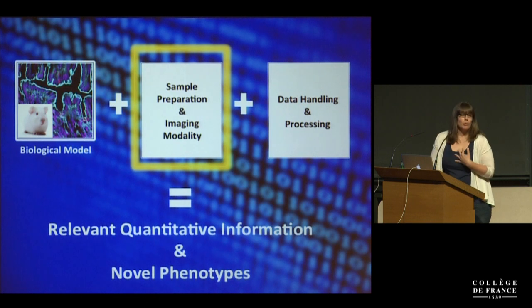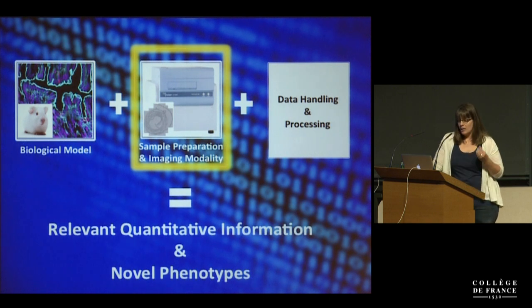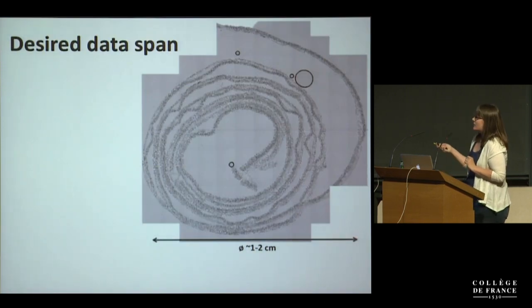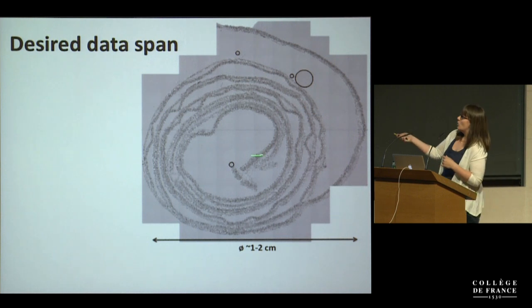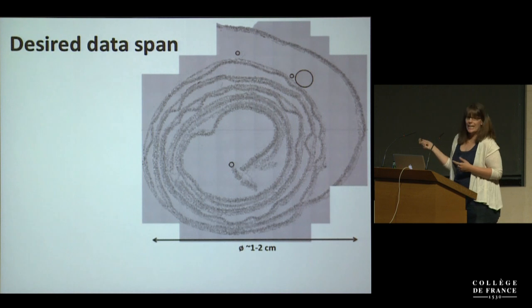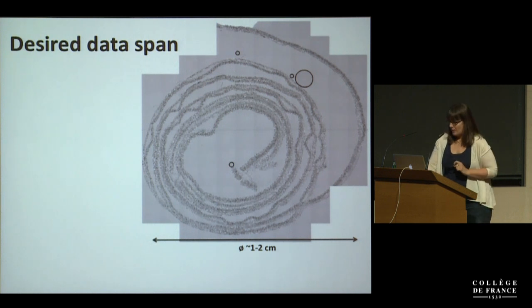And now to discuss our sample preparation and, of course, our choice of imaging system. As we need to really maximize the amount of colonic tissue that we're imaging, so we're properly sampling the infection progress, essentially what we did was prepare the colonic samples as a Swiss roll. So we take the 10-centimeter distal part of the colon, and we essentially roll it up and do transversal cuts. So this is 10 centimeters in length. So in the end, we have a massive amount of tissue that we really need to sample, and at high resolution so we can resolve individual bacterium and find their locations.